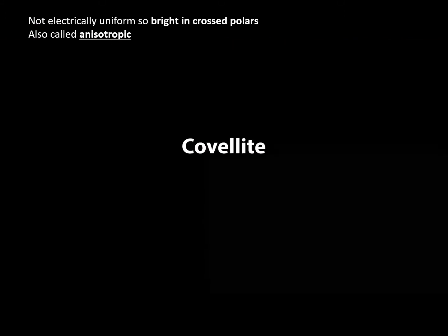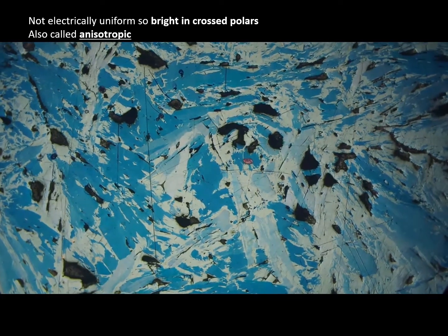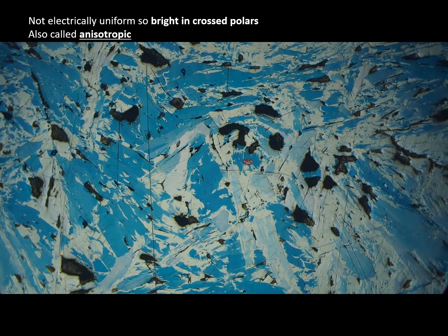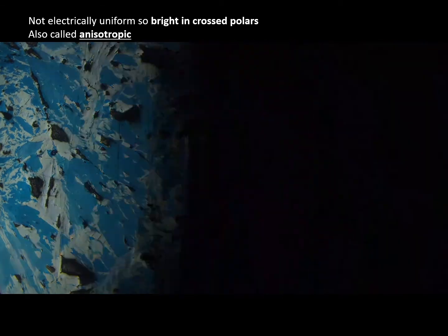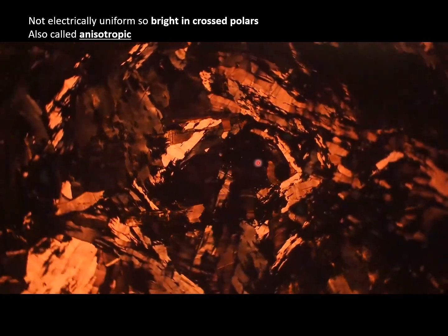Now we're going to have a look at covellite. Again, here it is in plane polarized light, and we can see it's rotating. Now we're switching to cross polars. And this time we can see these bright yellow-orange crystals.